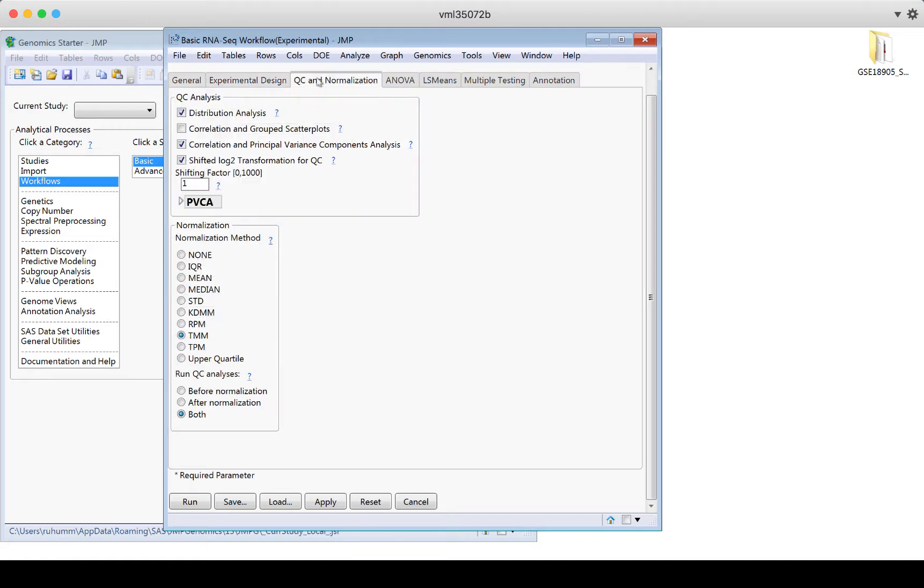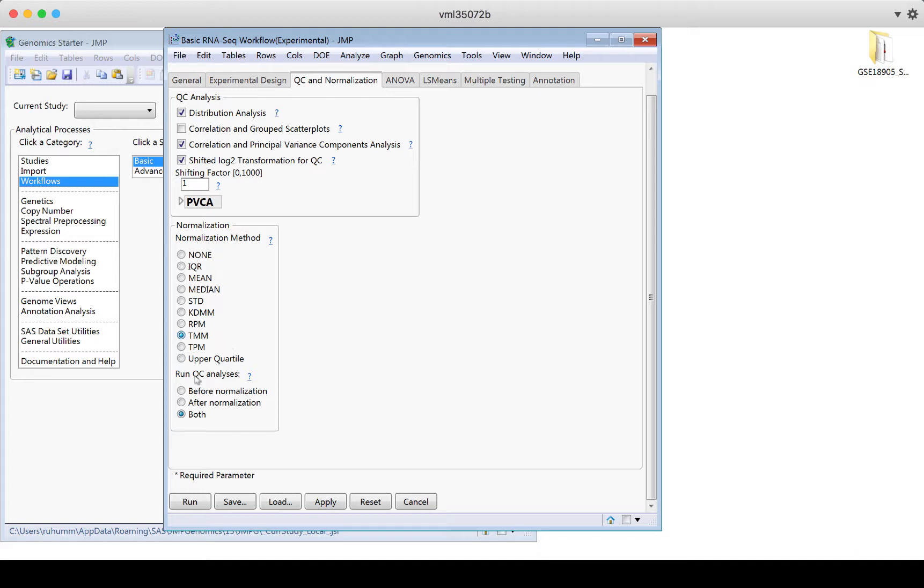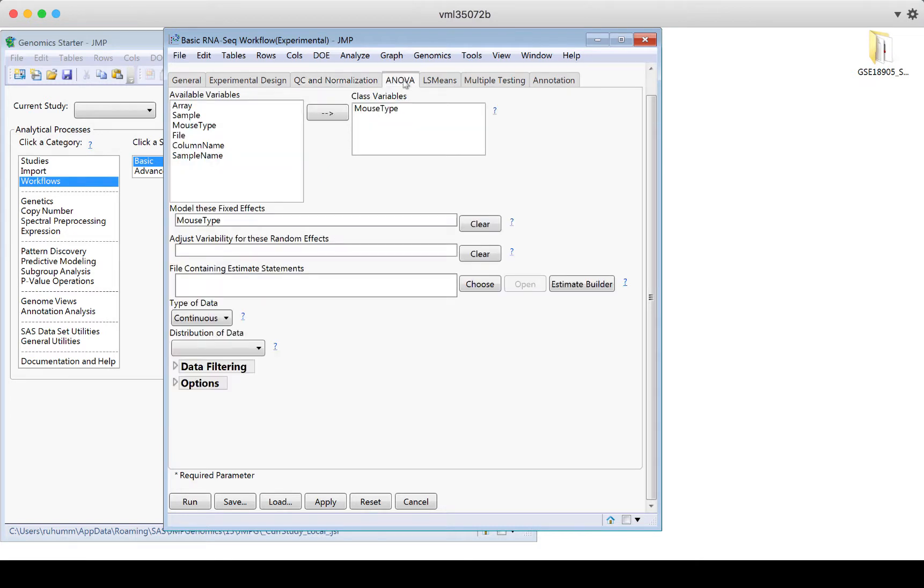If I go to QC and normalization, I can see that I've got some selections already made for this example. So I'm going to do a distribution analysis. I'll look at the correlations and principal variance components analysis. I'm going to do a shifted log 2 transformation. Again, click on question marks if you want to know what these things are doing. And then I'm going to use one normalization method, the TMM. I'm going to run the QC analysis both before and after I normalize the data so that I can compare what my results look like before and after using this normalization method.